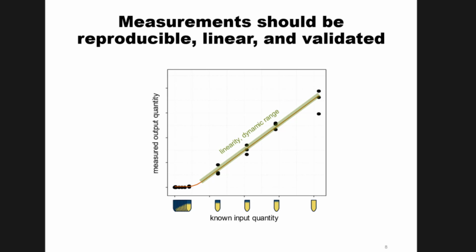Another question? Yeah. When you're talking about how low of one particular peptide I can quantify, you do not compare range across several peptides, right? Each one of these curves is for one peptide, one analyte. And I know Sue in the past has done each individual transition, because different transitions, even different product ions, might have different calibration curves depending on if they're interfered with or not. So I think most commonly I see this at the peptide level. Sue is really hardcore and does transition level.